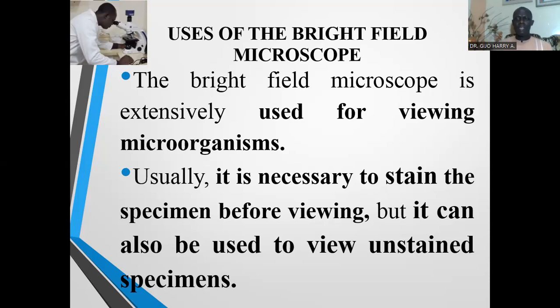For instance, the protozoans such as the amoeba, the paramecium, the chlamydomonas, and others can be viewed without being stained.